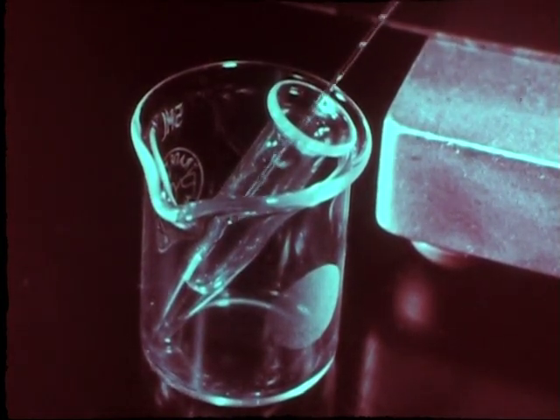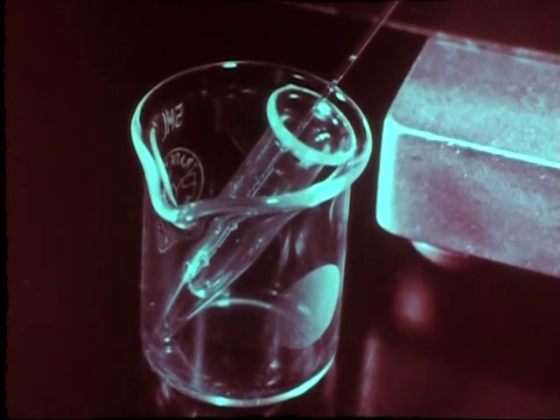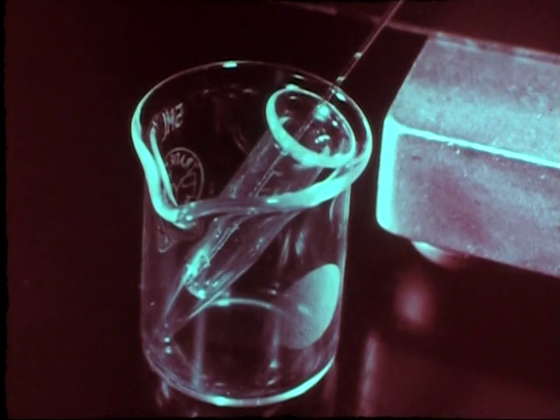On September 10th, 1942, in room 405 Jones Hall at the University of Chicago, a tiny measured volume of plutonium nitrate solution was drawn from a microcone.